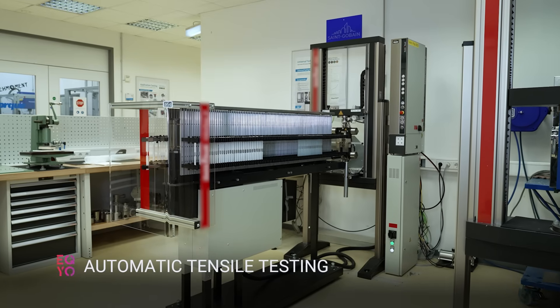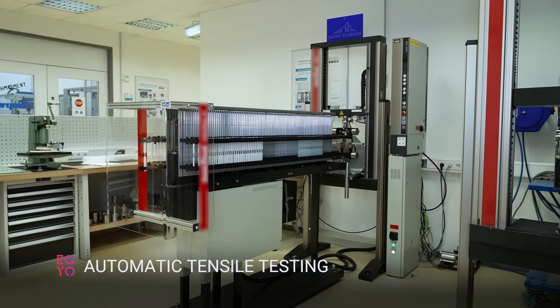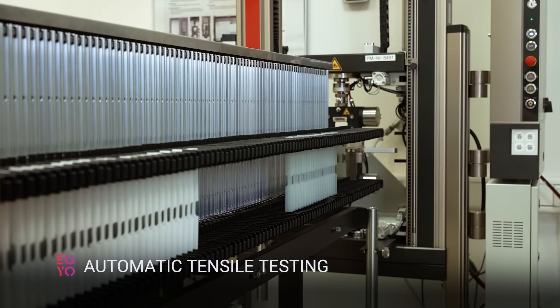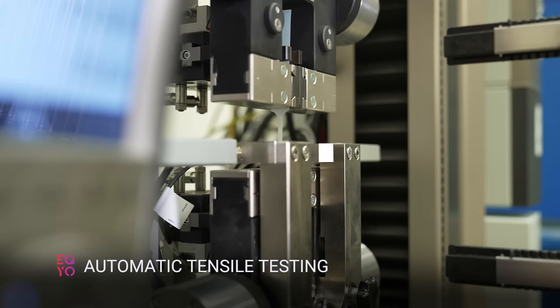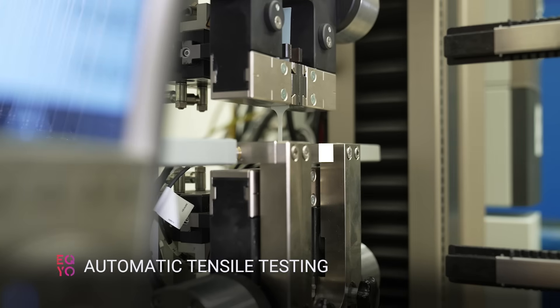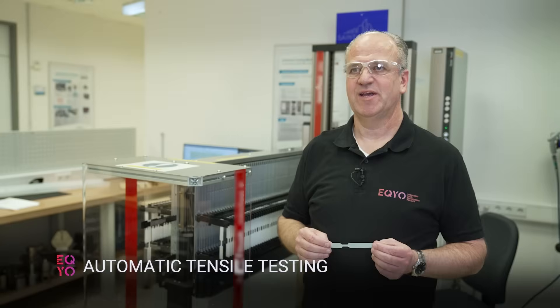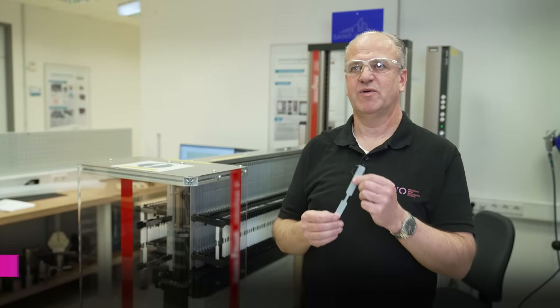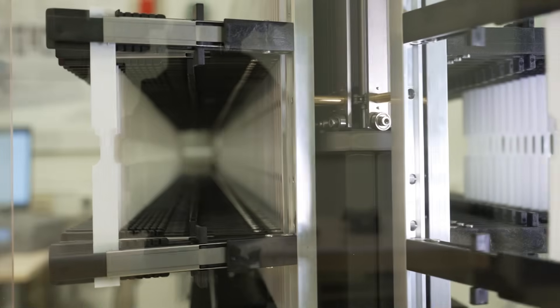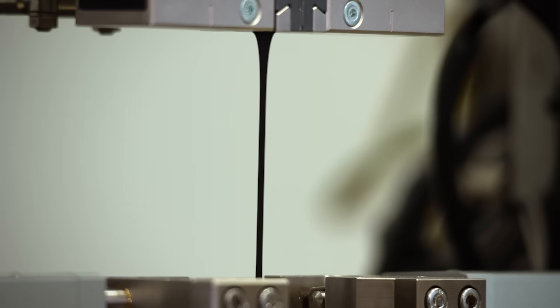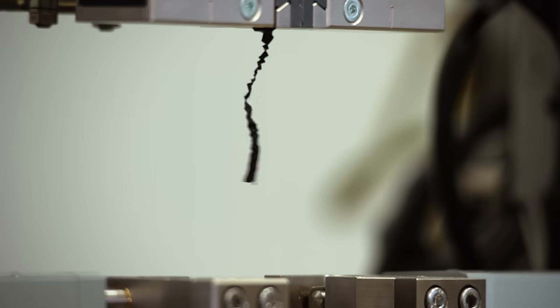What you can see here is a robot test. This robot test is a fully automatic tensile testing machine, and this machine is able to measure those dog bones automatically, which means tensile elongation as well as thickness.